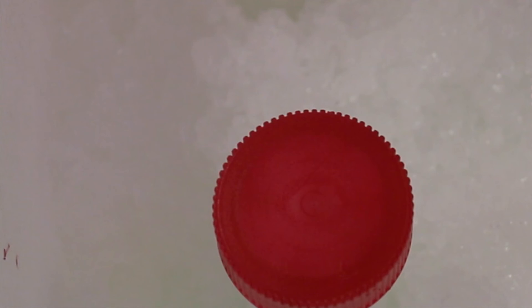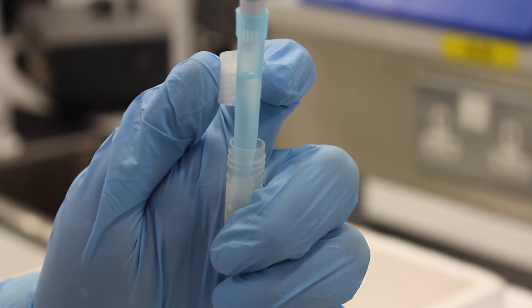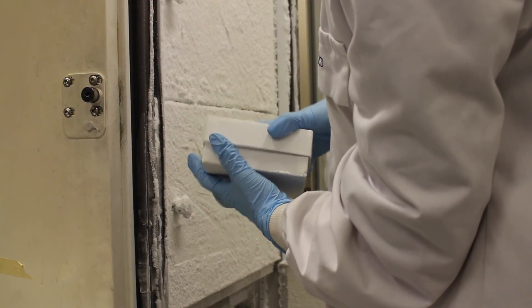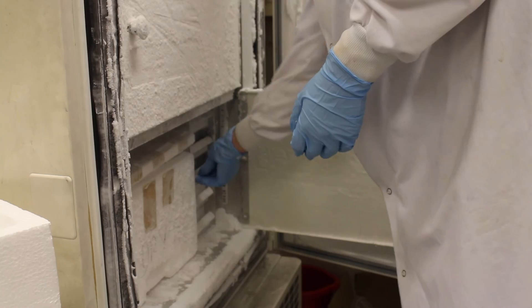The re-suspended pellets are then incubated on ice for 20 minutes. Aliquots are then made into pre-chilled cryo tubes and the cells can be stored at minus 80 degrees Celsius. These cells can now be used for a transformation.